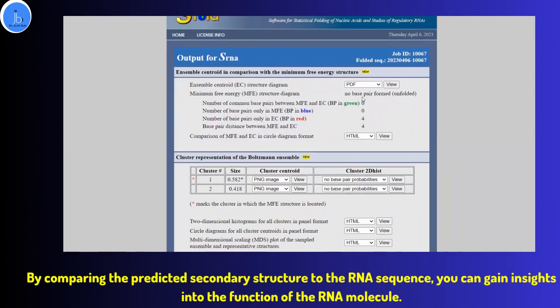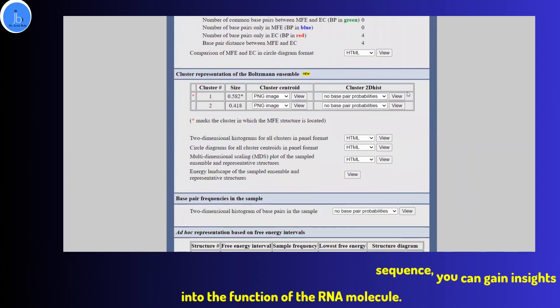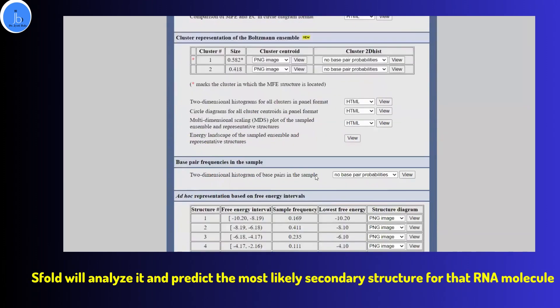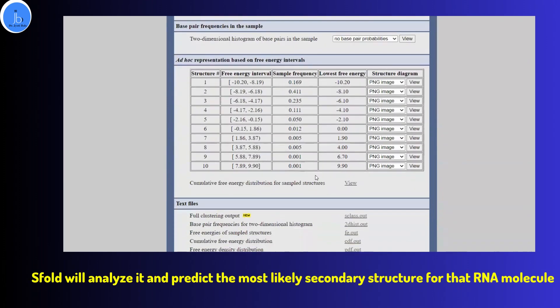For example, you might be able to identify regions of the RNA that are involved in binding to other molecules, or regions that are important for catalytic activity. In our RNA aptamer project, we often use this platform.